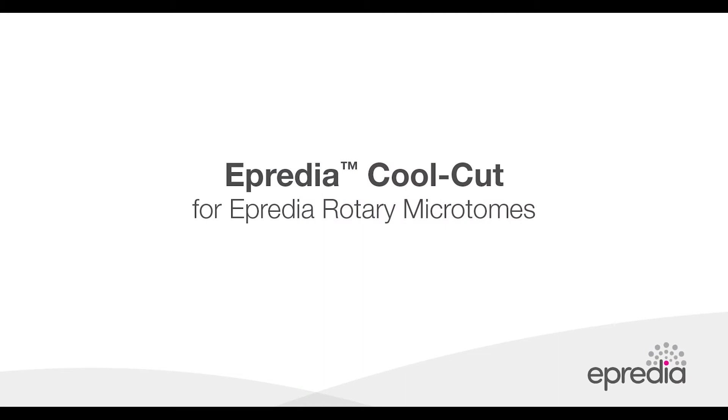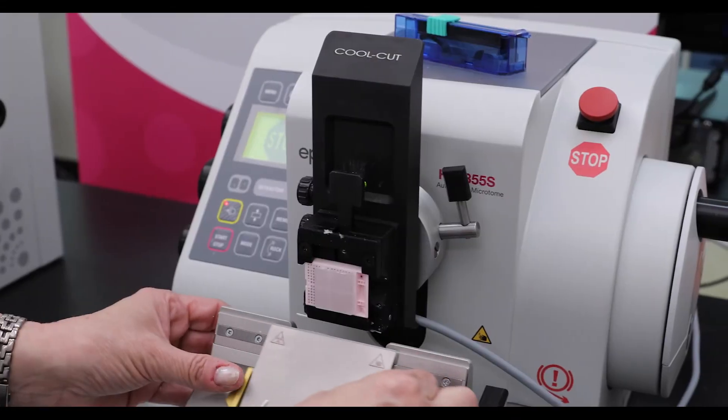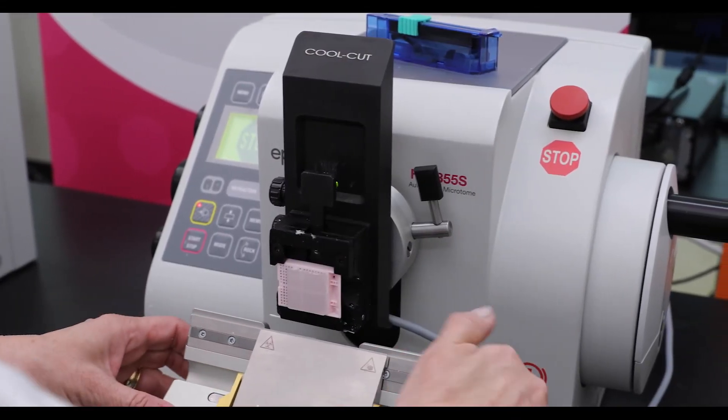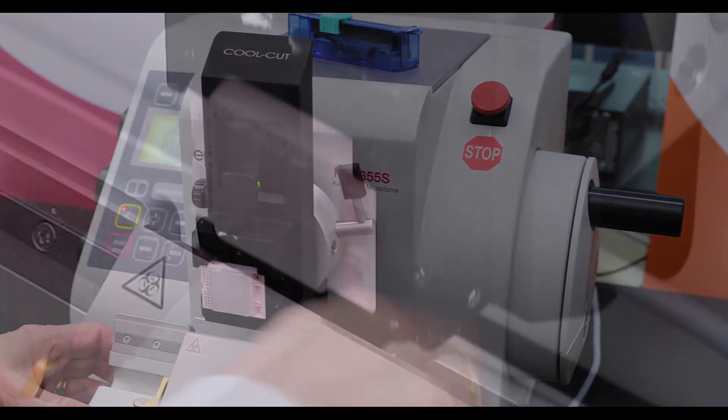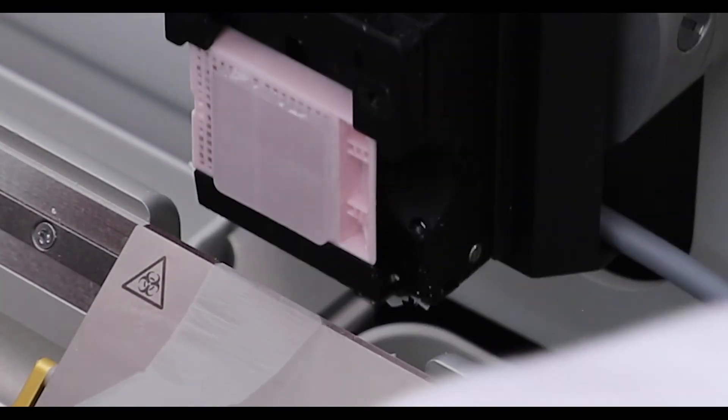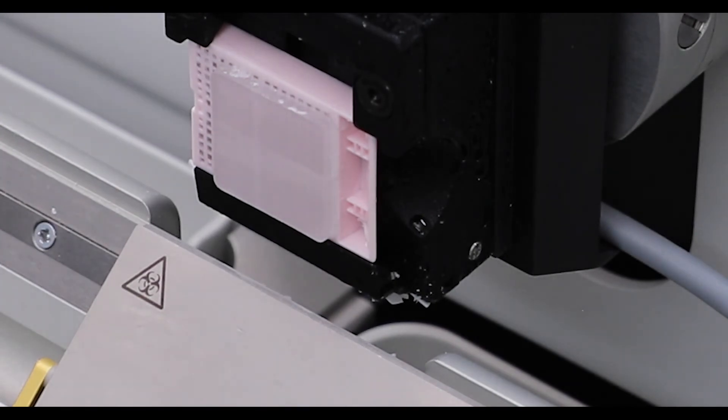Another accessory for the Epredia rotary microtomes is the cool cut. This is an actively cooled specimen clamp designed to keep samples cold to ensure good section quality and is especially good when taking multiple sections. The clamp temperature is maintained at 16 degrees Celsius below ambient temperature.